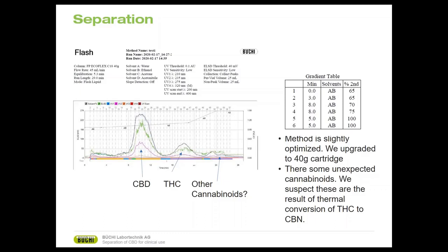So there's something very surprising at the end. There is a very tiny peak on the end. So this oil was put under the thin film distillation. Under the thin film distillation, as we mentioned, there is a rotation column, and this rotation column is heated. So we can evaporate the terpenes and the chlorophylls later on. However, while you have the cannabinoids and when they are heated, we know that the heat converts THC to CBN.